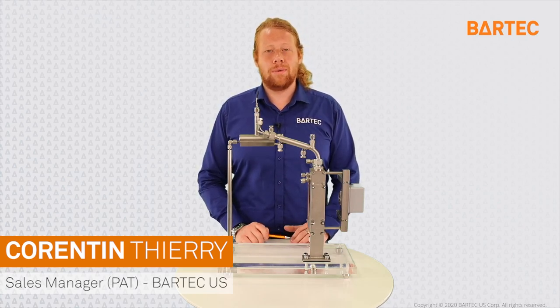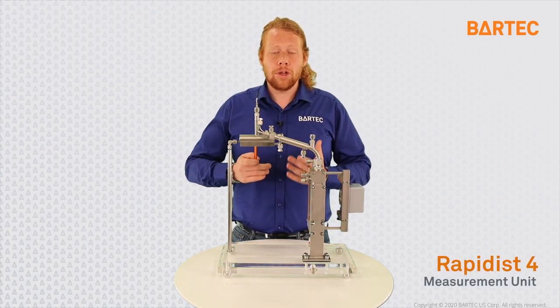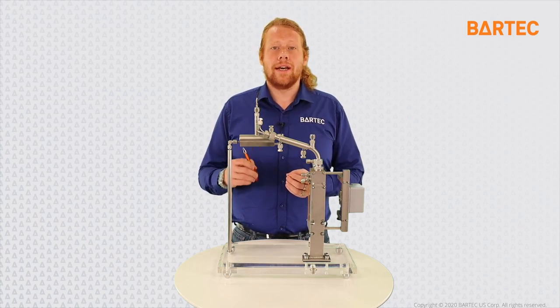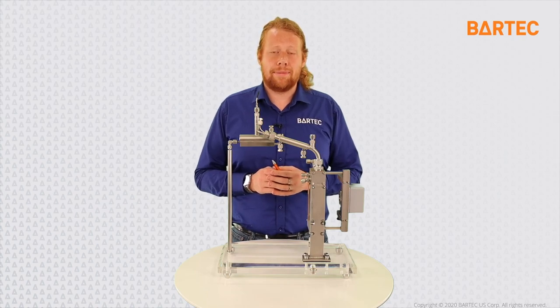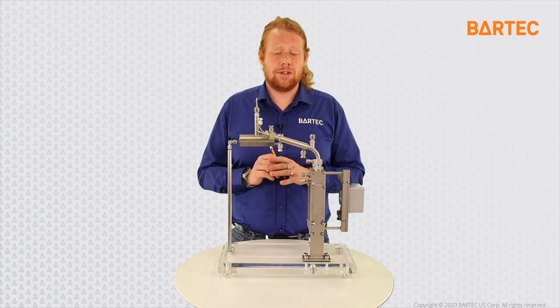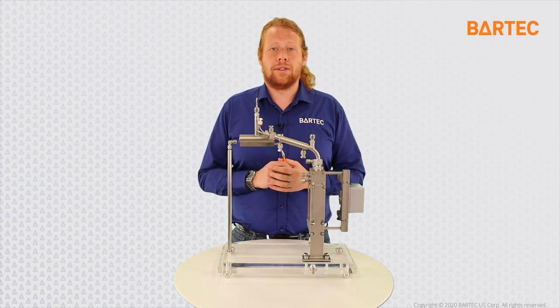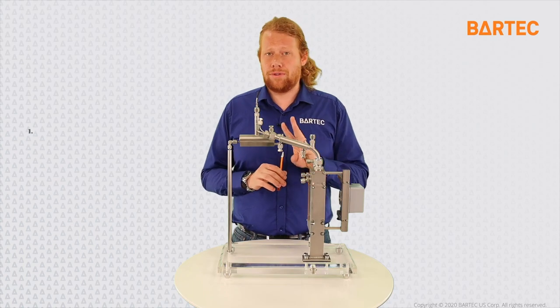Today in this video, we will be discussing the rapiDist-4 measurement unit. The rapiDist-4 comes out of the BARTEC Benke factory in Germany and is part of one of the two distillation analyzers that BARTEC Benke and the BARTEC Group manufactures. In a few minutes, I will quickly go over the differences between both analyzers before diving deeper into the rapiDist-4 measurement unit. In this video, we will cover three sections.